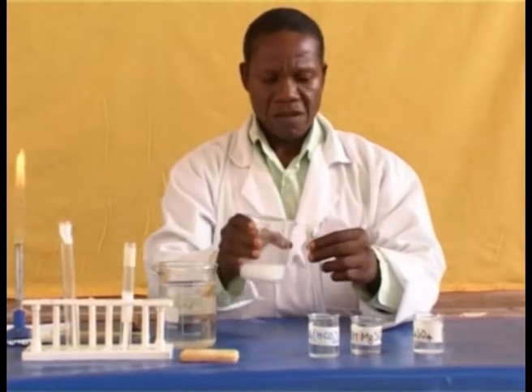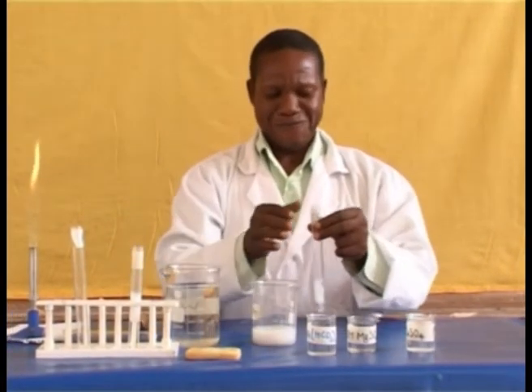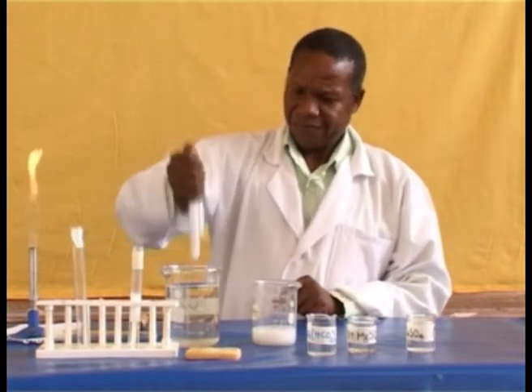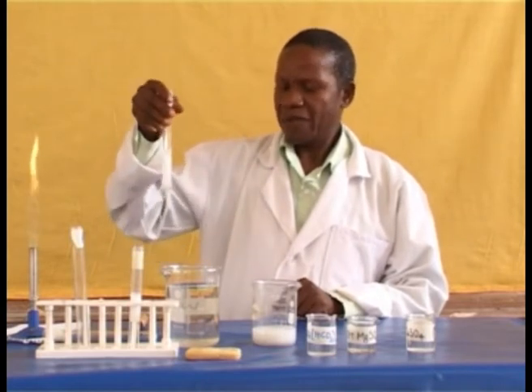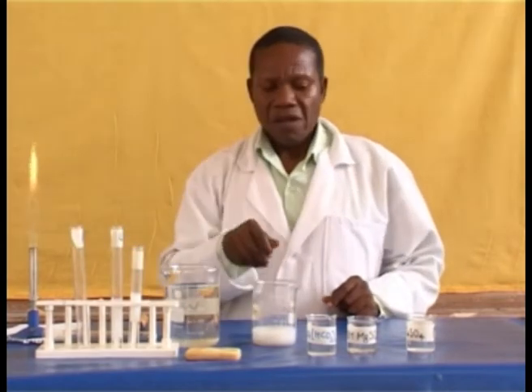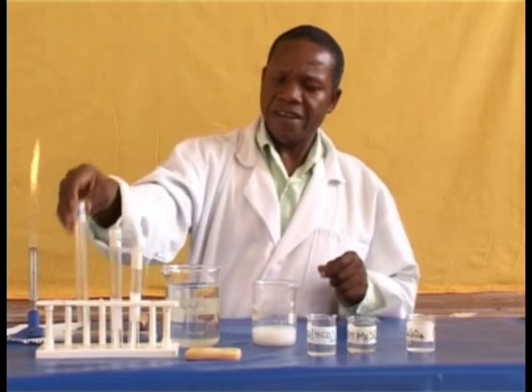Add soap solution. Shake. Again, even after boiling, no lather is formed.